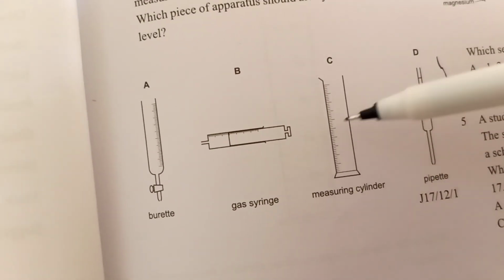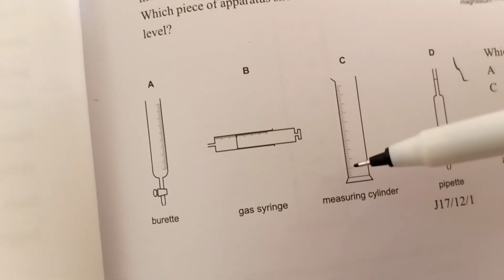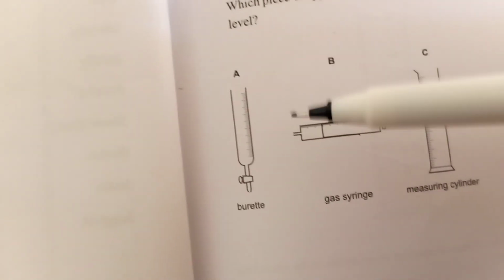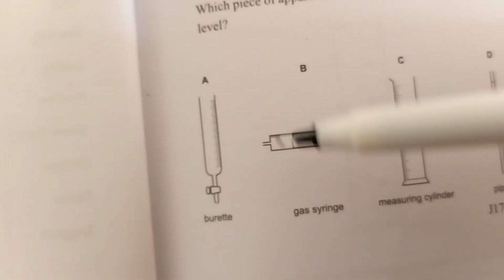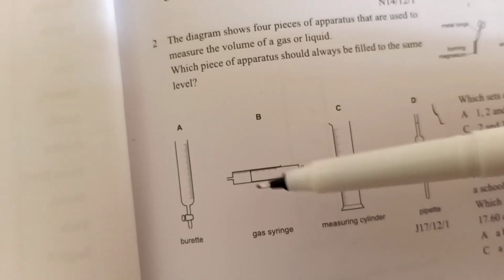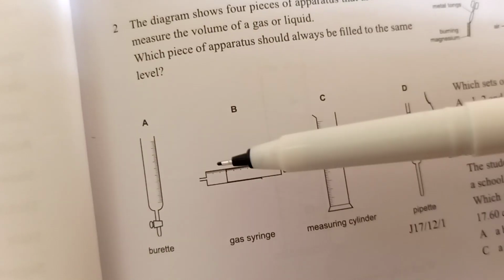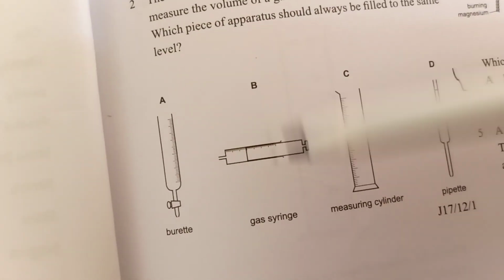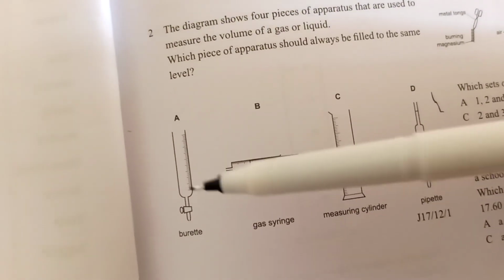This we can vary. Measuring cylinder we can vary. We can measure 10 centimeter cube, 20, 30, things like that. This also can vary. We can collect 20 centimeter cube of gas, 30 or 40 centimeter cube of gas, so we can vary.